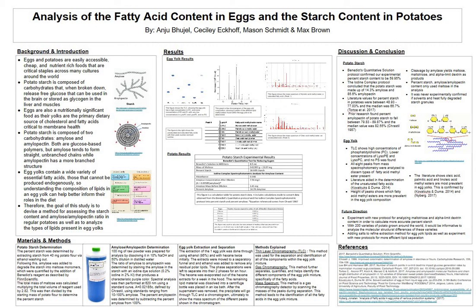So I'm going to be explaining the materials and methods and results for the egg yolk. When going about our methods for the egg yolk for extraction and separation, we based it off of Kowalczuk's and Dumas' study. We used it because it had very similar intentions and results that we were looking for, which was basically the composition of fatty acids within the egg yolk.